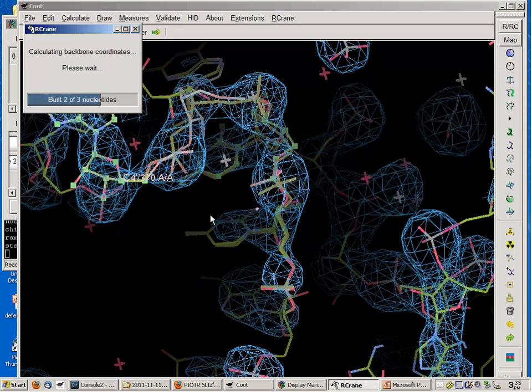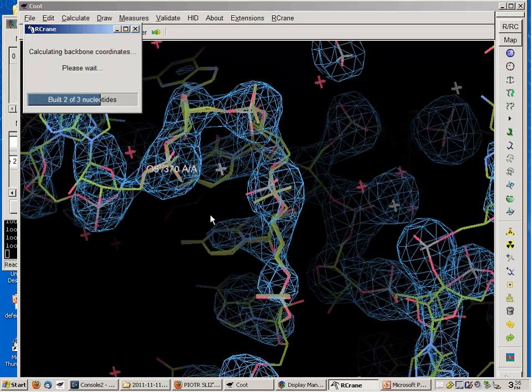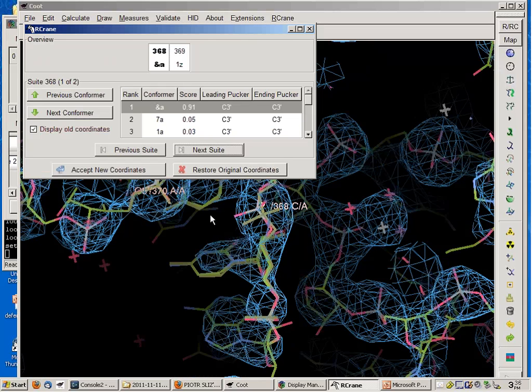Okay, so a couple more questions from the audience. People were asking about the alternative conformations, if it's something that you could accommodate. So, alternate location indicators. Right. Yeah. Right now, RCrane can't. If you try to rotamerize something with an alternate conformation in there, RCrane will give you an error message. If you try to build one, you'd probably have to trace it twice and then manually tweak things so that one is an alternate conformation for the other. That's something I can work on, but at least right now, unfortunately, no is the answer.